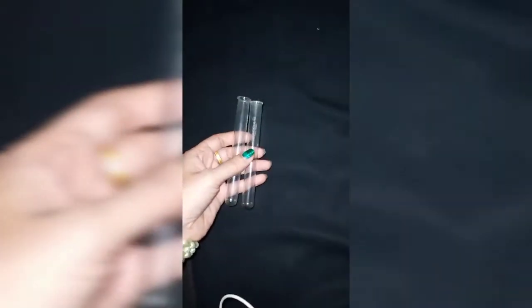We also get burettes of 25 ml capacity. Now these are called test tubes. They are used to carry out simple reactions. These small-mouth test tubes come in a measure of 5 to 10 ml. These are ordinary glass test tubes. Where reactions include high heating or high boiling, we get boiling test tubes which are used for stronger heating.